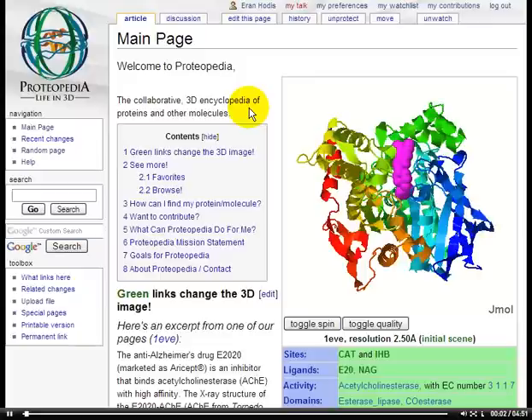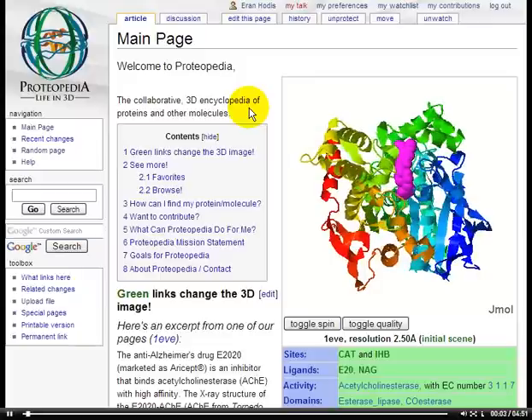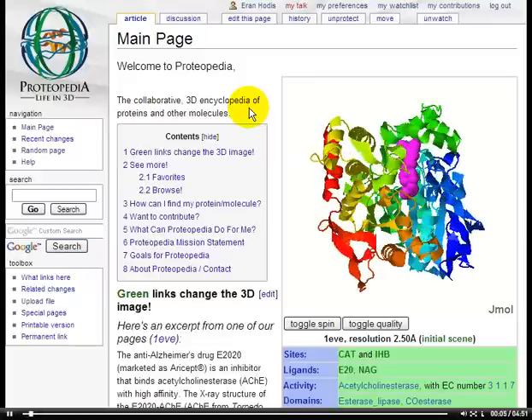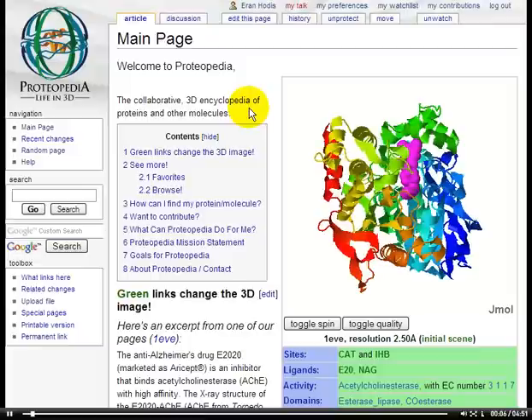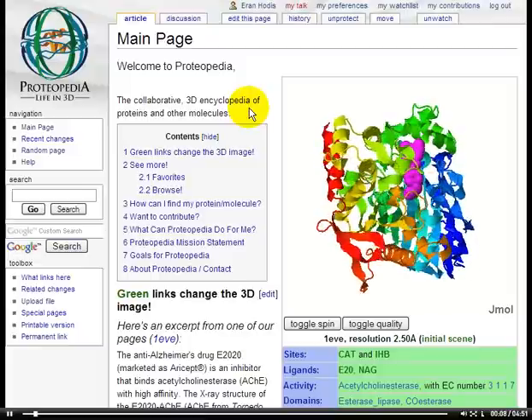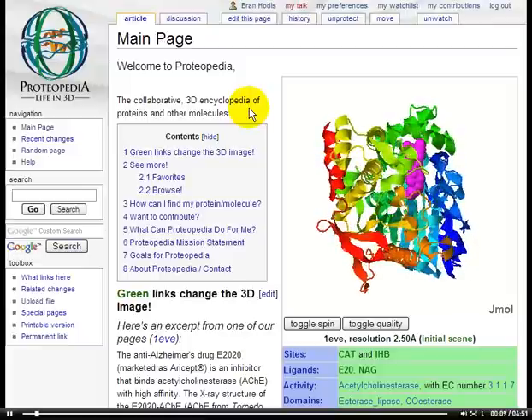Hi, Ron here. In this episode of the Proteopedia Video Guide, I'll teach you how to add an applet to a page in Proteopedia.